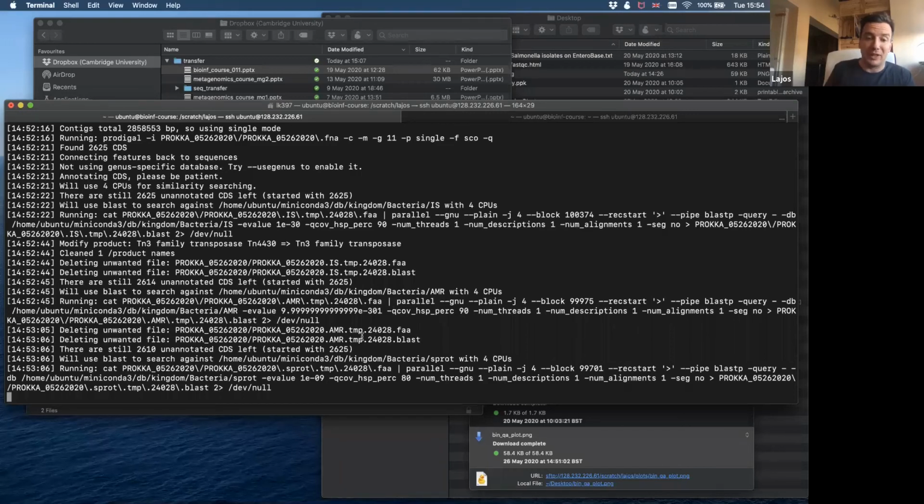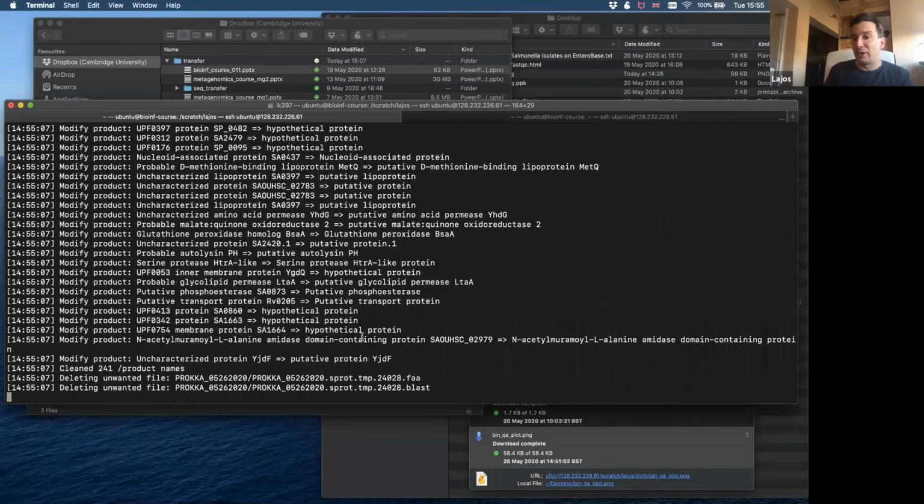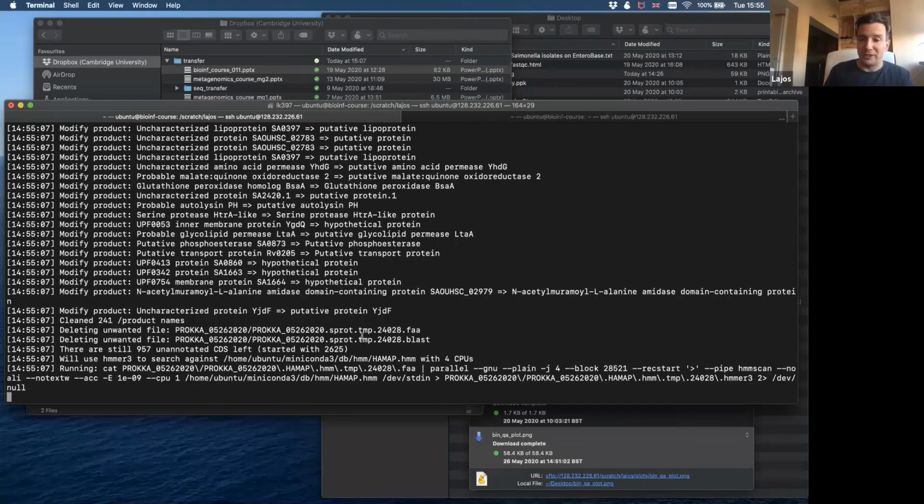But for example, if you have a subgroup in your 100 isolates, which are phenotypically a bit different. So for example, you found out that 10 of these 100 isolates are resistant to specific antibiotics or are very happy to grow on a specific agar or a specific nutrient.